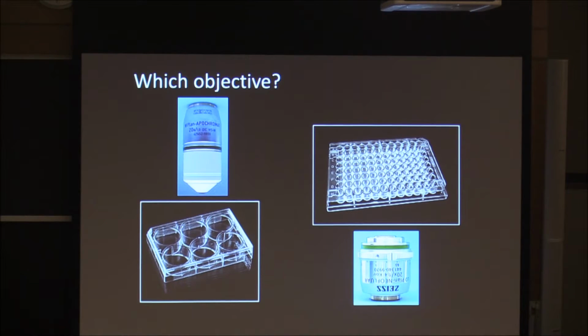So the numerical aperture here is only 0.4, while with the normal 20x, you're usually at 0.8. The other thing, when you're trying to cover this many wells, you're not going to be able to use an immersion objective anymore. If you try to use an oil immersion objective, once you get about 5 wells down, all of your oil is smeared off across that plate, and you don't have any left. So this is a situation where you're going to be stuck with air objectives.